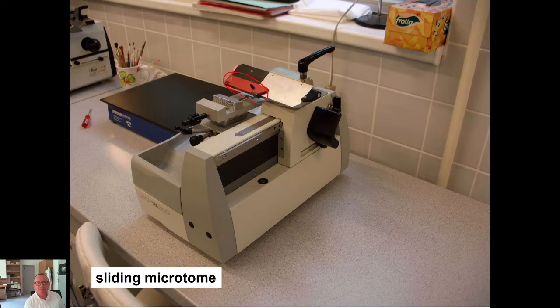It's steel, and in this part of the microtome the paraffin block is fixed, and the laboratory assistant is moving this part of the microtome forwards and back, and during each way of the knife along the block the thin section is made and can then be collected.